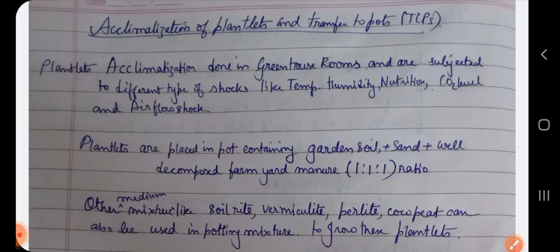Now this is the main time where we have to observe, because initially the plantlets were growing in conditions where we were providing all the nutrients that a plant needs. Now the plant has to absorb the nutrients from this mixture. That's why we call it acclimatization. This is the time where the plantlets will be subjected to this type of shock, to see whether the plants are able to absorb the nutrients from the soil or not.